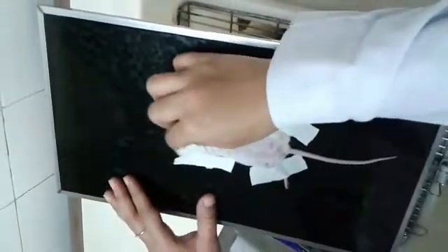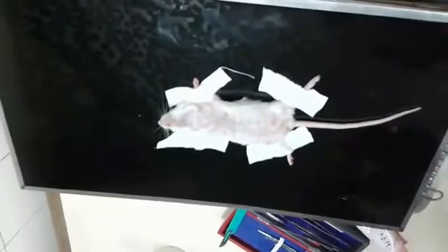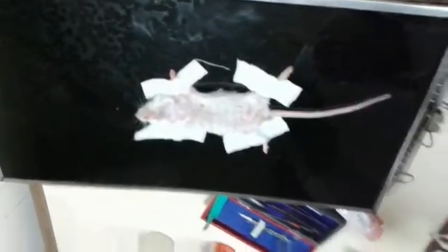With the help of hair removal cream, clean the hairs in the neck region. With the help of cotton, clean the area properly, followed by cleaning with spirit and cotton again in order to remove the remnants of hair removal cream.